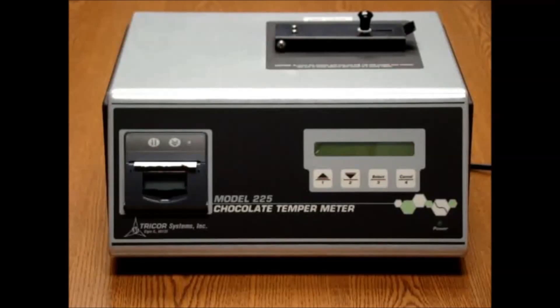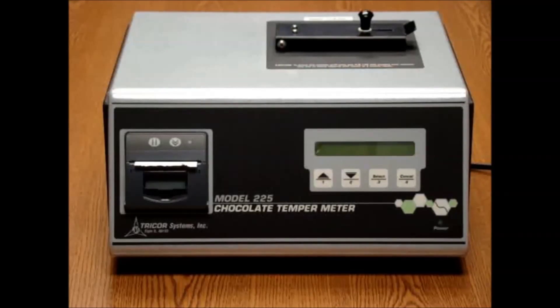Hello, thank you for purchasing the Model 225 Chocolate Temper Meter. The following video will provide a quick start demonstration on how to use the system.